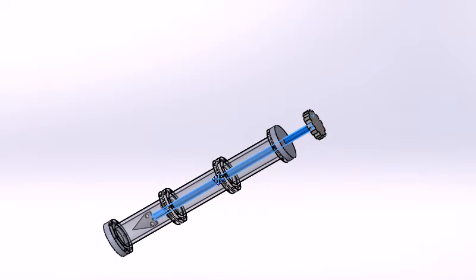What we really have here is three identical chambers. They can be made out of stainless steel or a biocompatible aluminum alloy. In between the physical barriers we could use a thin sheet of neoprene or even some biocompatible waxes.